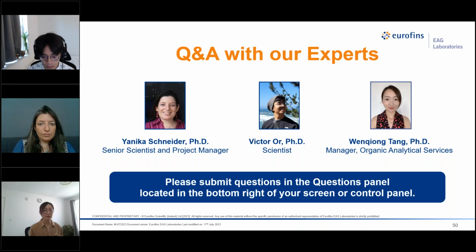There are also circumstances where something shows up as a defect, but when we try to analyze it, it turns out to be the same type of material. Those can be just mechanical artifacts on your sample, and we have imaging techniques such as optical or SEM imaging that can further help to characterize those types of defects. So it really depends on the actual type of defects that you are looking at, and then we have a full suite of techniques that can be utilized to study that.